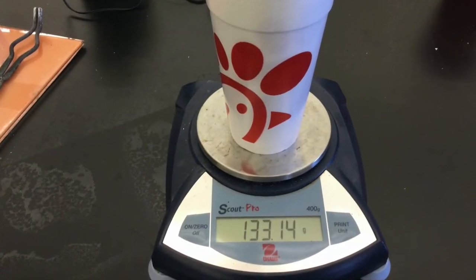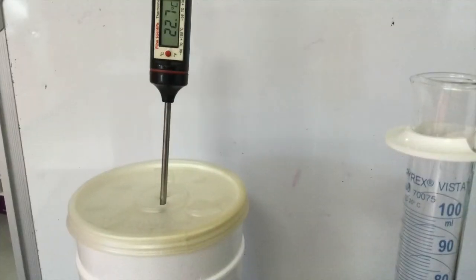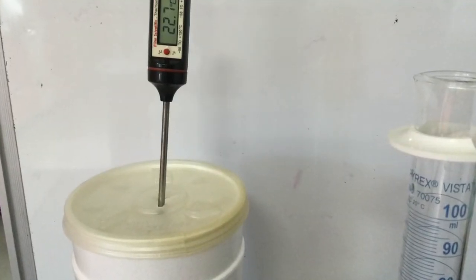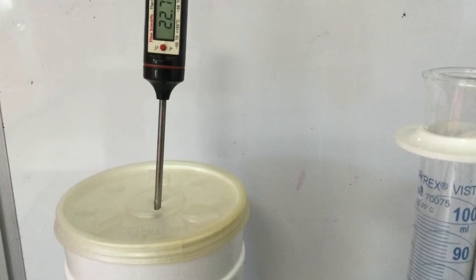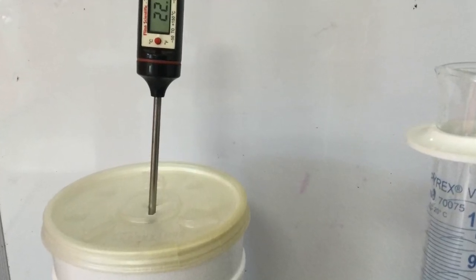Pour 100 milliliters of room temperature deionized water into your calorimeter. Then you will need to measure the temperature of the water in the calorimeter. Be sure to let it sit in the calorimeter for a couple of minutes to be sure that it has equilibrated.